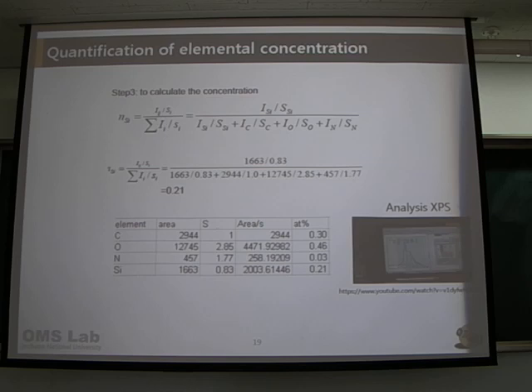So we are just discussing not only the X value, the eV. From the eV we can tell which electron it is, whether it's 1s or 2p or whatever. But we can also get some information from the peak width as well. But that is more difficult because many atoms overlap. I think Sang-Hyun gave an excellent seminar on that, how to separate. We have to separate. Yes, deconvolution. Anybody who has to handle XPS has to be careful.